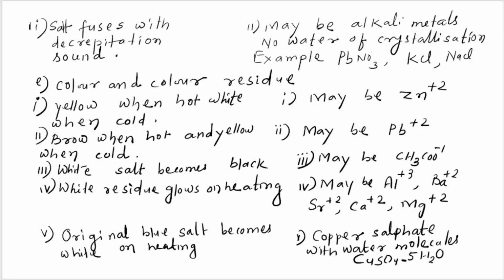Color and color of residue. Here what is the color, and after the residue forms, what is the color of the residue?